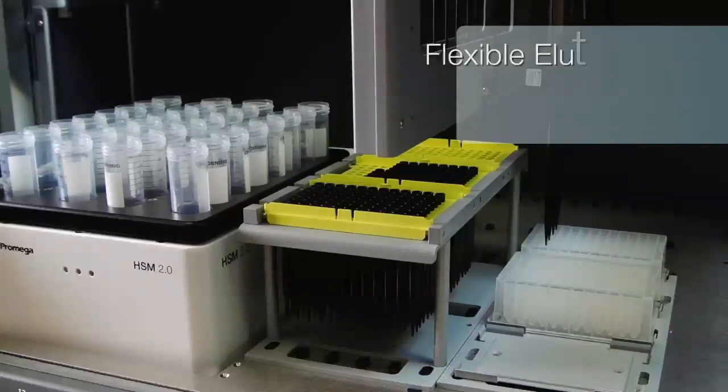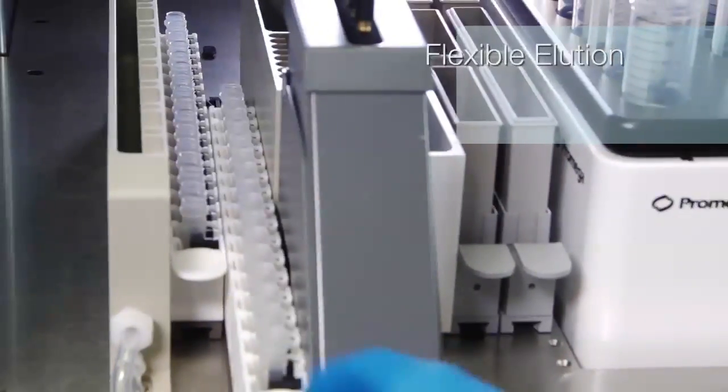Samples may be eluted into any format SBS plate, or they can be eluted into individual 2 mil tubes.